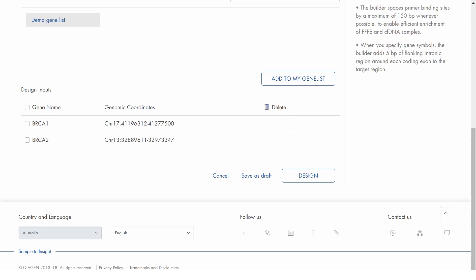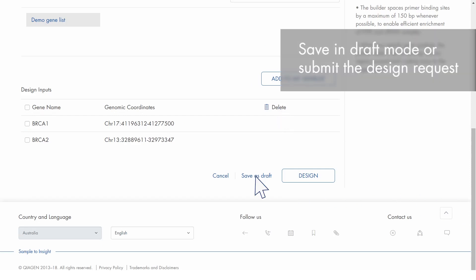If you need to continue with the design later, save your panel in draft mode and access it again from MyGeneGlobe. When you're ready to submit the request, click the Design button.